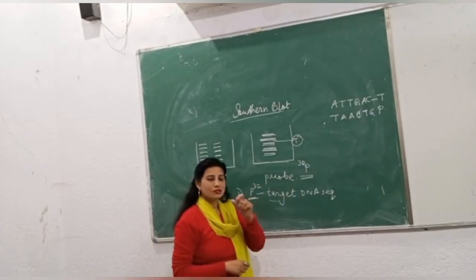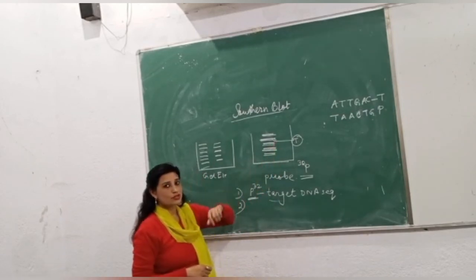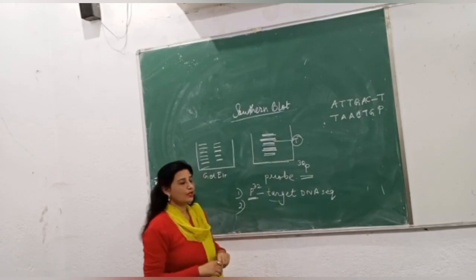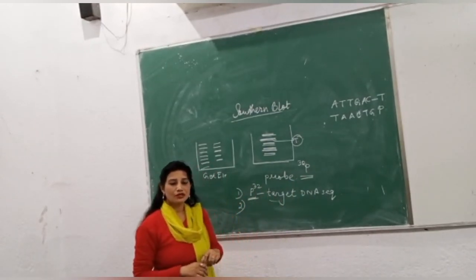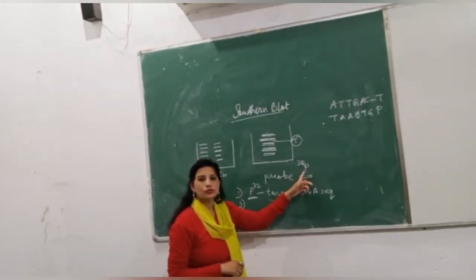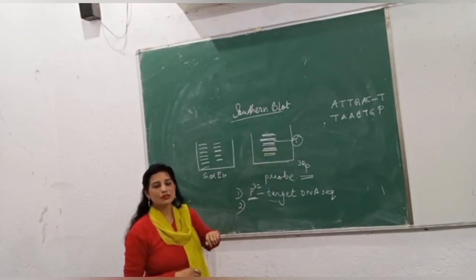The probe was single stranded. It has the complementary base pair of my target DNA sequence, so it got attached to the particular DNA molecule. Now to locate it, I have exposed it to the X-ray film under UV light, and I have applied the P32 radioactive isotope, which gave me a very good result that it could locate the particular DNA sequence.